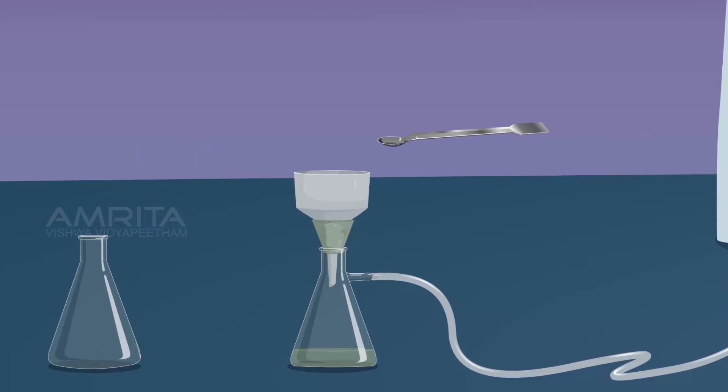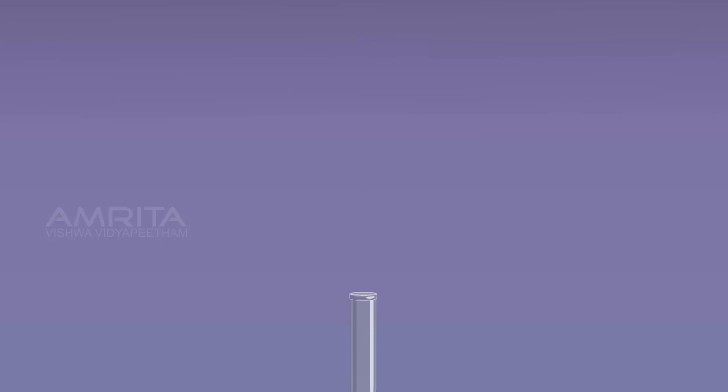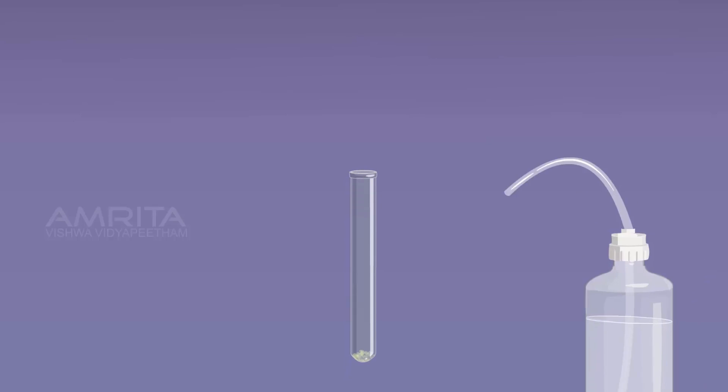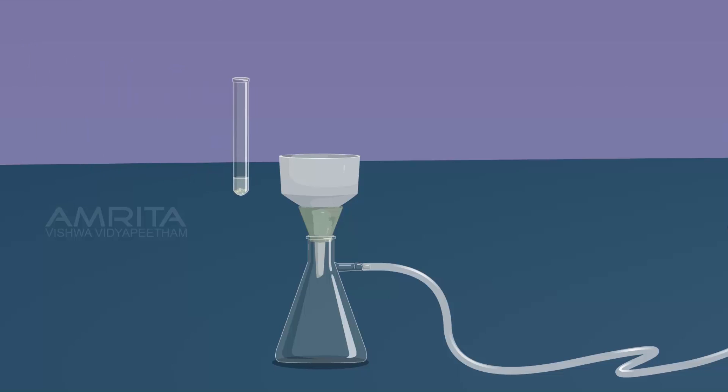Using a spatula, transfer the precipitate into a test tube. To wash the precipitate, pour distilled water into the test tube and shake it well. Then filter the contents of the test tube through the Buckner funnel.